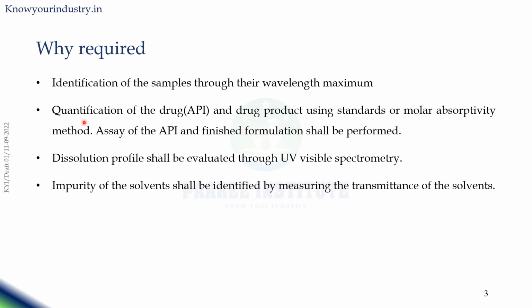Then the UV visible spectrophotometer is also used for the quantification of the drugs from the drug products using the standards or molar absorptive method. So the assay of the active pharmaceutical ingredient or the finished formulation will be performed using the UV visible spectrophotometer, either using the standards method or the molar absorptive method.